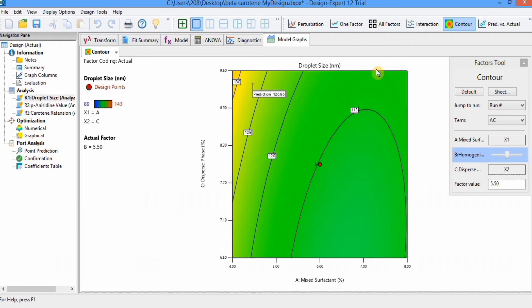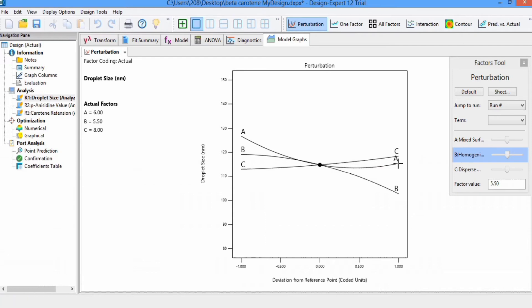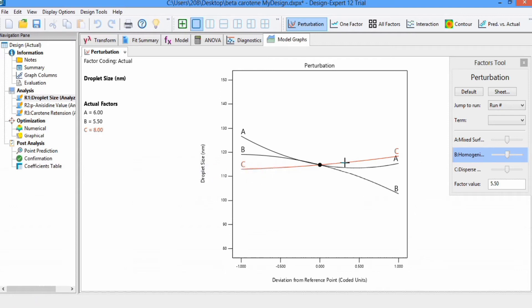Now we will explore other graphs. Here is the perturbation graph. You can see what type of factors have an effect on this response. You can see that factor A's response decreases with the passage of time and then at the end starts increasing. This overall response of the factor appears in this graph. For factor C, which is the dispersed phase, the droplet size increases with an increase in this phase.